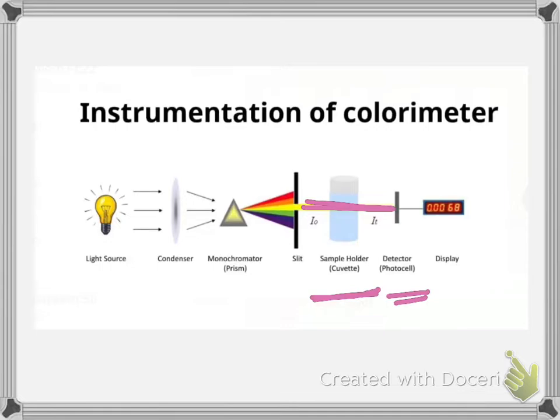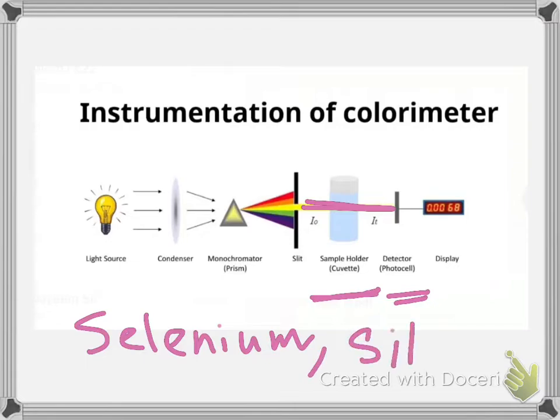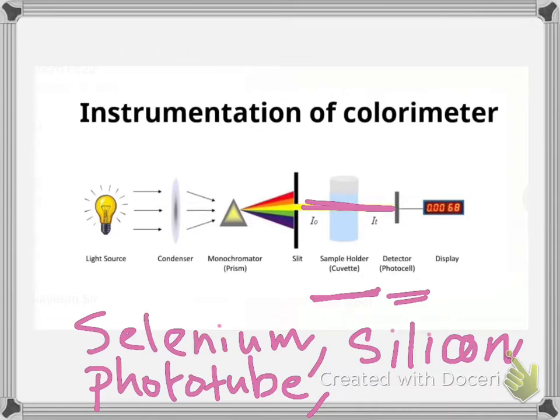Usually selenium photocells, silicon photocells, phototubes or photomultiplier tubes are used as the detector.